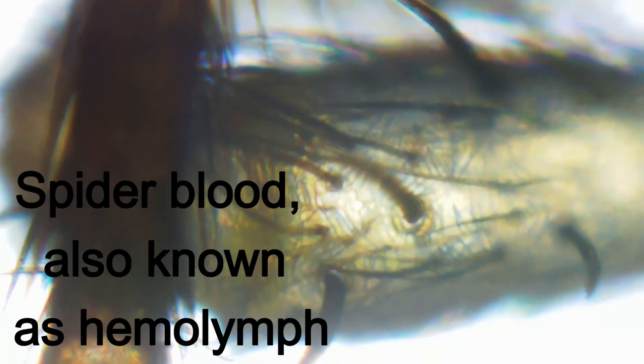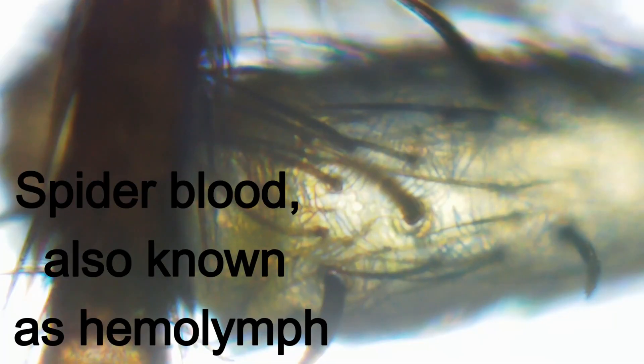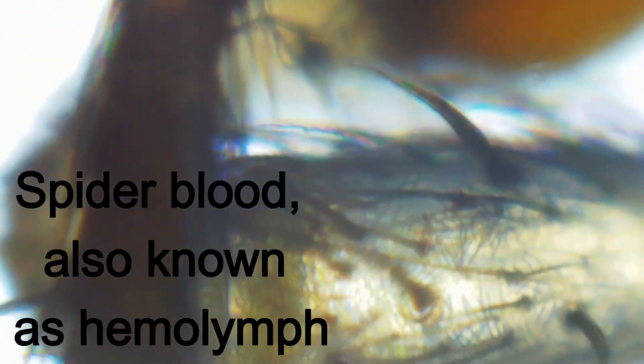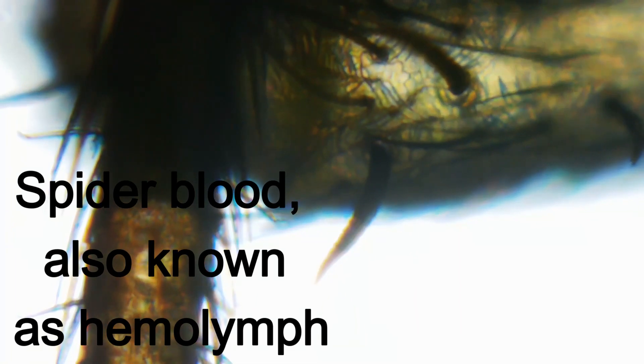And what a web it is, unlike the perfect spirals of an orb-weaver spider. The American house spider prefers a tangled, three-dimensional cobweb. An architectural mess to our eyes, but a brilliantly efficient hunting ground to the spider.